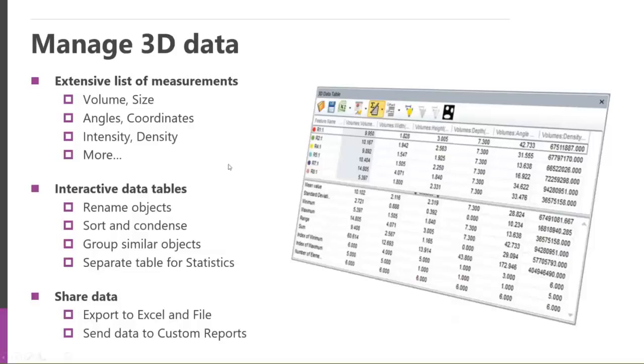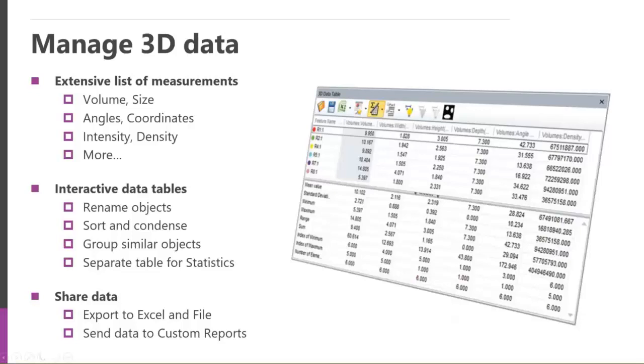The output, kind of in 2D, we can kind of modify the view, make it very specific as to the type of view of data that you want to have, and then export that to Excel or send it out to our data collector within ImagePro. It's kind of like having an Excel spreadsheet on steroids within ImagePro. Or send it out to custom reports.